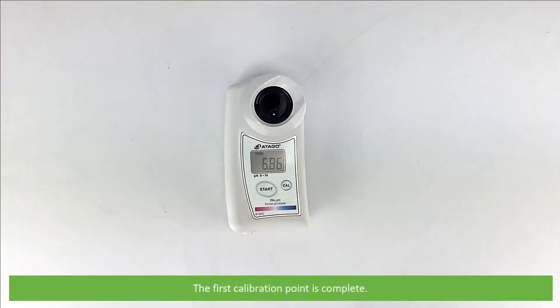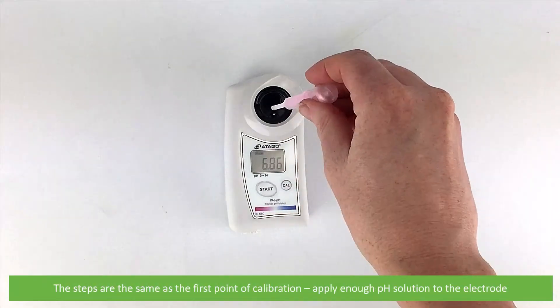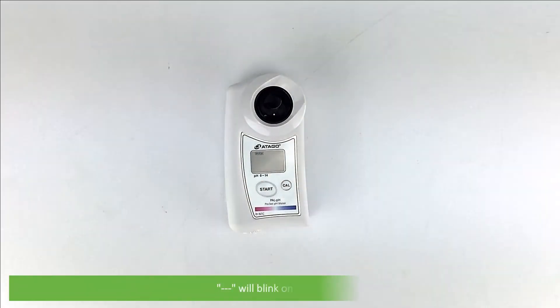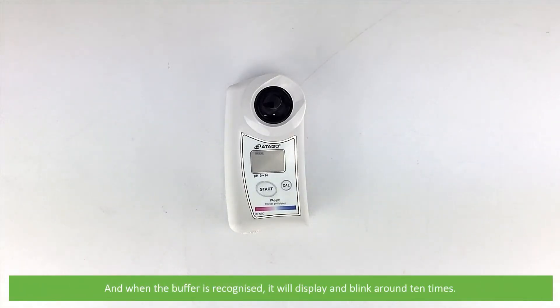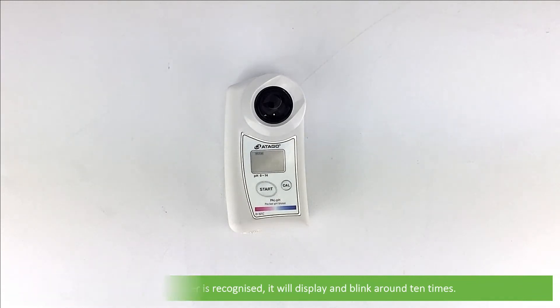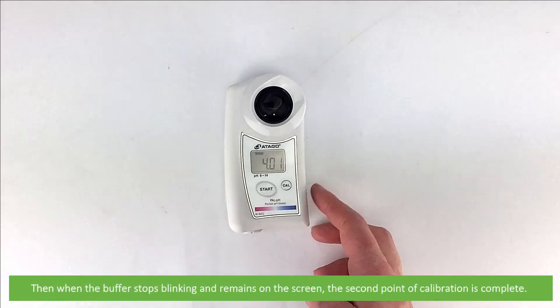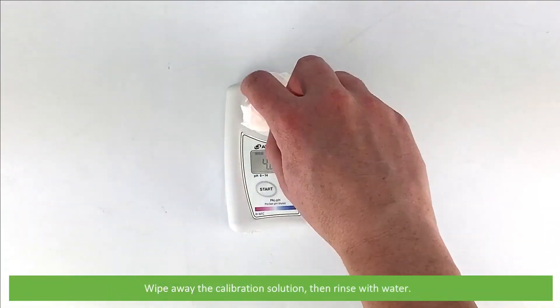The first calibration point is complete. Next we will calibrate to pH 4.01. The steps are the same as the first point of calibration. Apply enough pH solution to the electrode and press CAL. The three dashes will blink and then when the buffer is recognised it will display and blink around 10 times. When the buffer stops blinking and remains on the screen, the second point of calibration is complete. Wipe away the calibration solution then rinse with water.